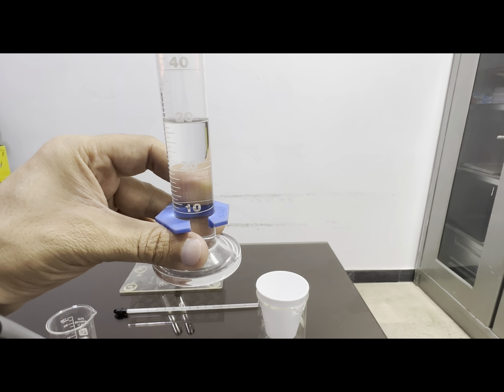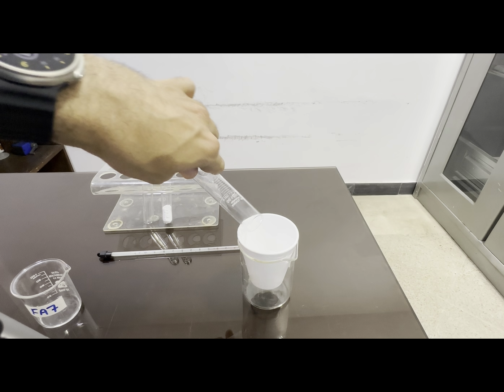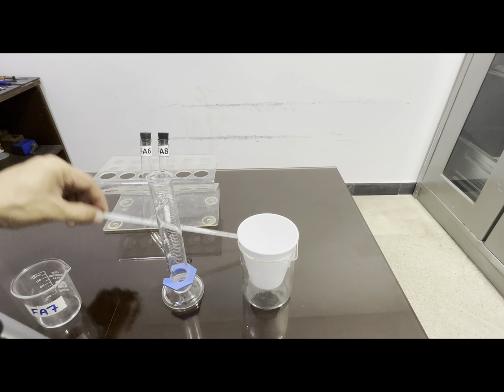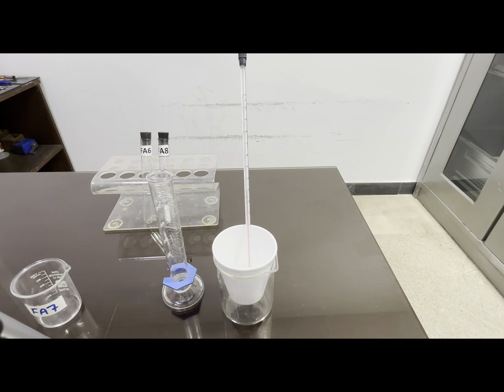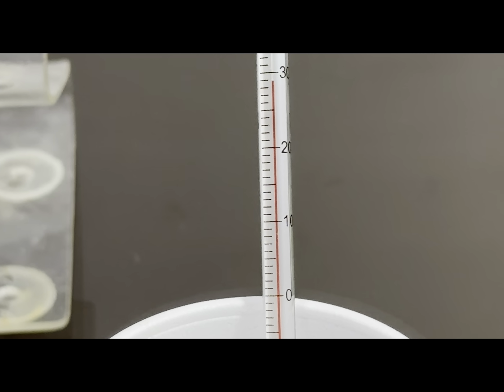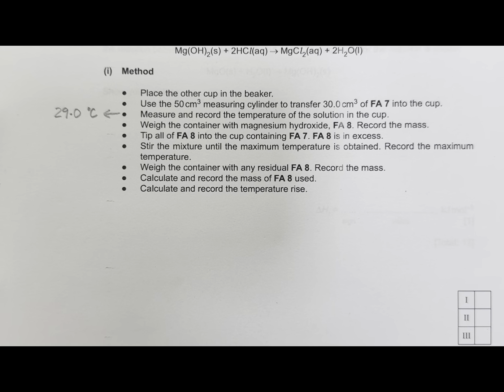The 30 centimeter cube of Fa7 is transferred into the cup, and measure the initial temperature. Wait 20 seconds to stabilize the temperature. Now the temperature is recorded as 29.0 again. So the temperature is recorded here, 29.0.